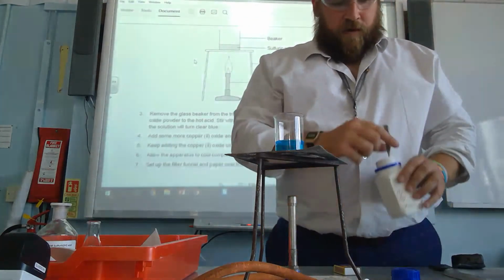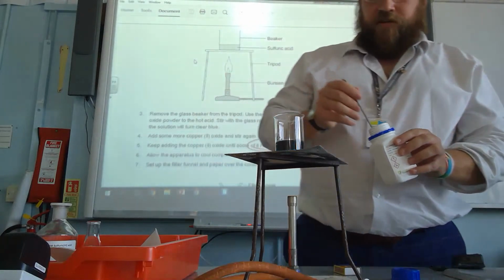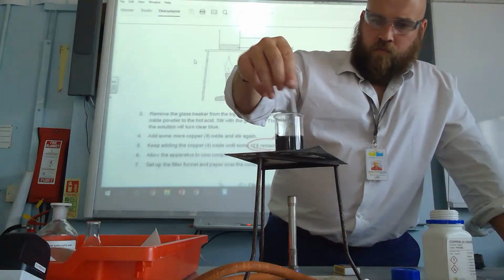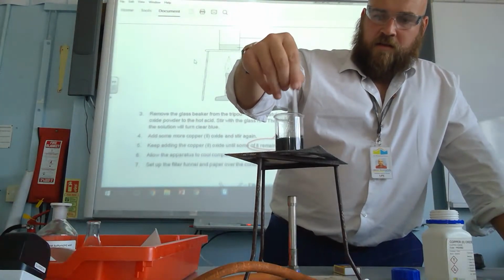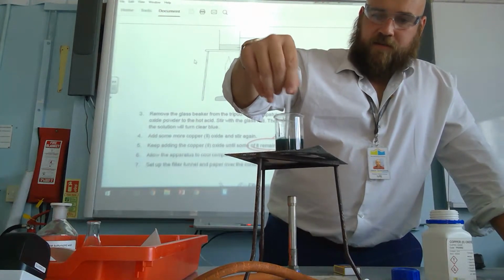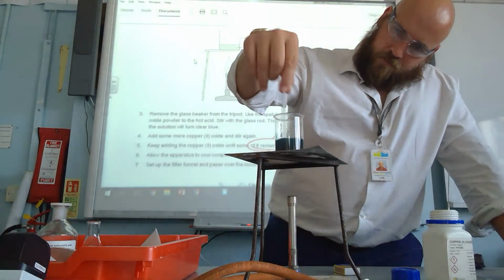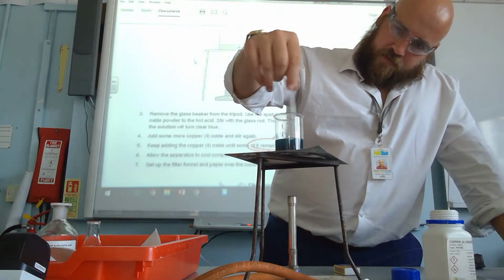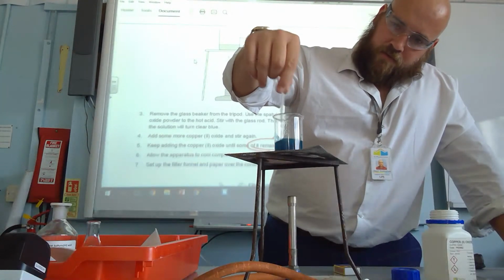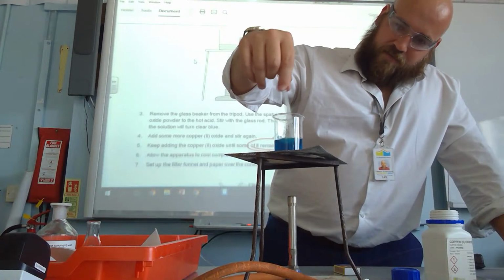Yeah, and then what I'll do, you keep going with that, and as I speed things up, I'm just going to add a big lug of it now in. So I'm pretty sure that will not all react. So it should just stay black, effectively. So I'm just going to keep stirring. So it's not going back to that lovely transparent blue colour. Yeah, a little bit, actually it might be. Tell you what, these are going to be some great crystals.